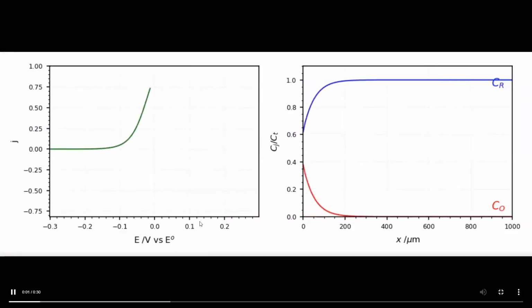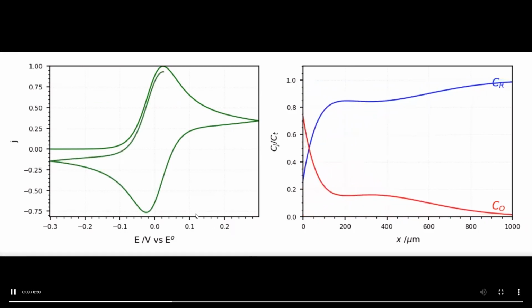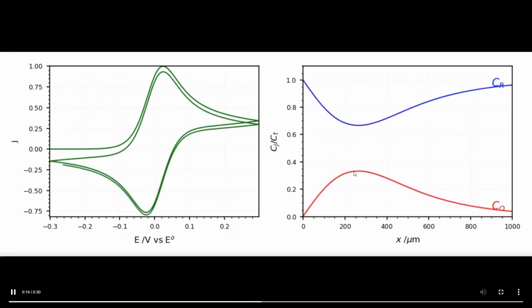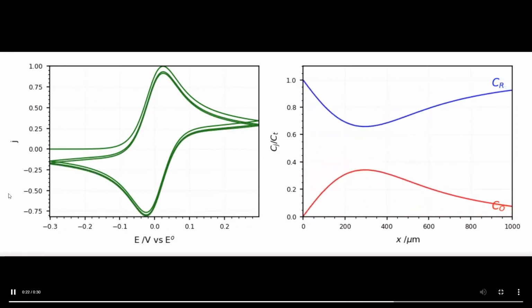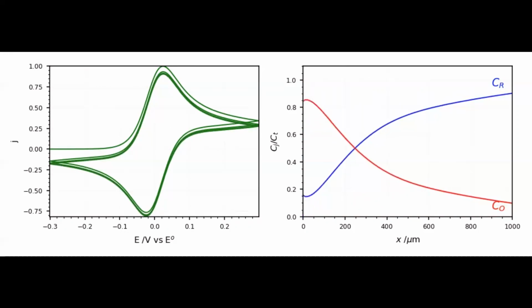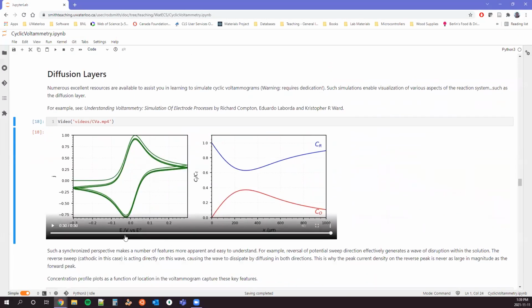So the left is going to be our cyclic voltammogram. The right is going to be our concentration gradients. And so we can see the growth, we can see the change, and notice, I'll let it come back around. Notice as we approach negative 0.3 volts, that we have this bulge, right? And so that bulge is what we're acting on when we have this offset over here in the negative voltage regime, right? And so we're continually perturbing the system at x equals zero at this surface, and it's forcing a change out into bulk solution. And so what we see is dependent on what we have previously done to the system, essentially.